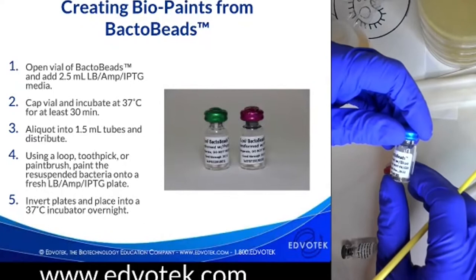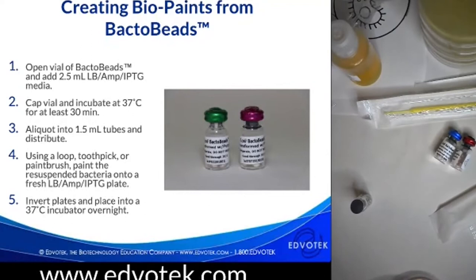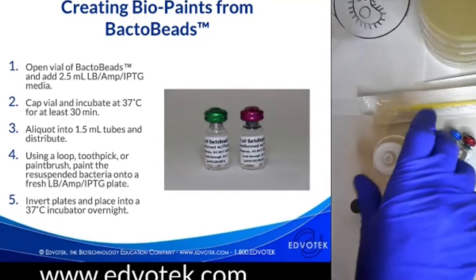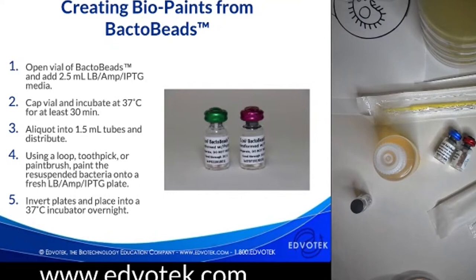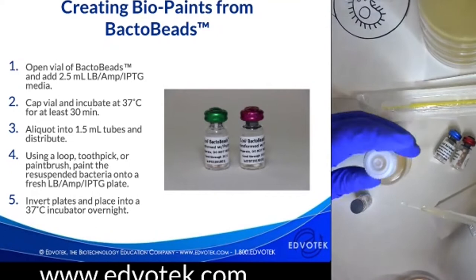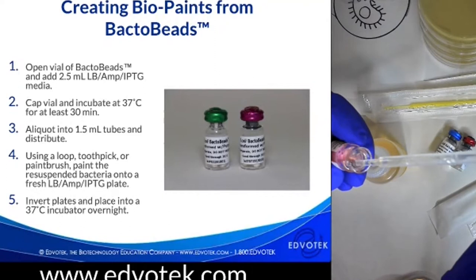If we're going to use this to make our biopaint, what we do is pretty simple. I have growth medium here that I've already supplemented with IPTG and LB. If you get the kit from us, it comes with the pre-measured amounts that you would use. I am just going to take a pipette and add 2.5 mL to the vial. I'm doing this at home, so I am using these calibrated pipettes. You probably want to use something a little more high tech than this to measure. But again, these biopaints are pretty forgiving, as long as you get the bacteria in there and resuspended.